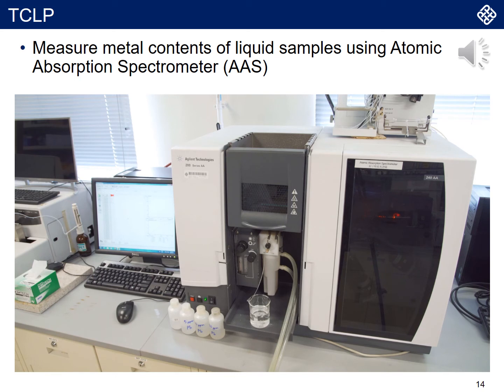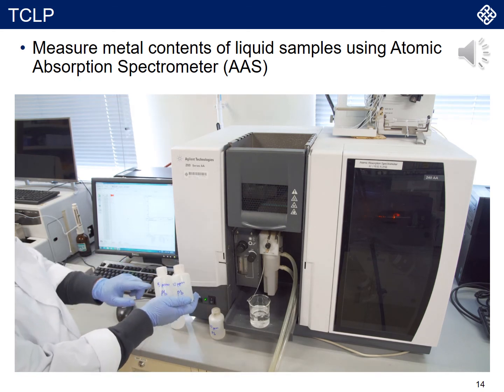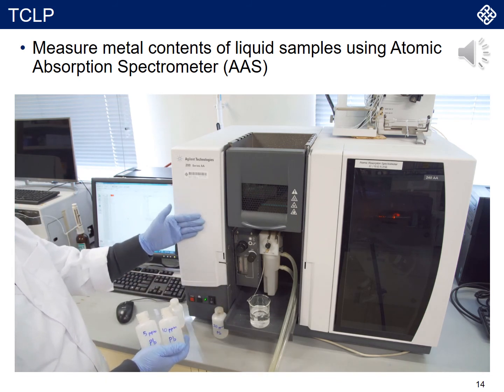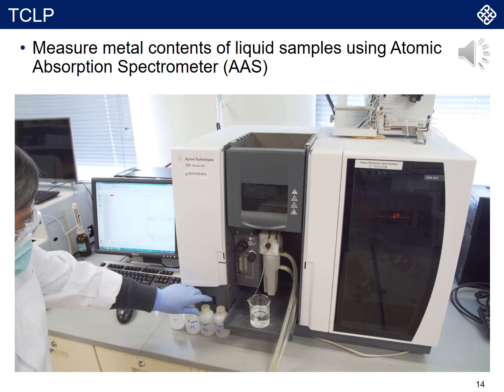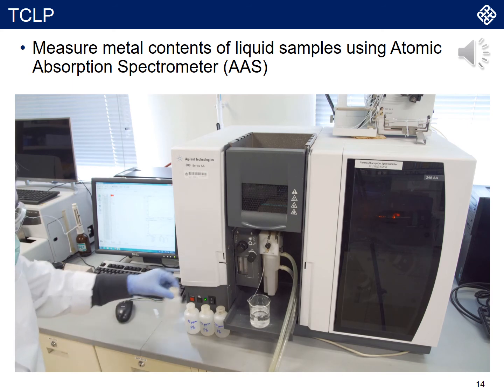By determining what color and wavelength of the light goes into the sensor, the computer can record the concentration and the type of the heavy metal. So this is to understand what is going on with the acid washing procedure.